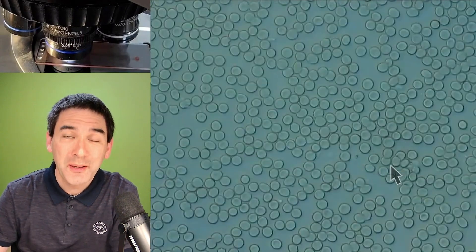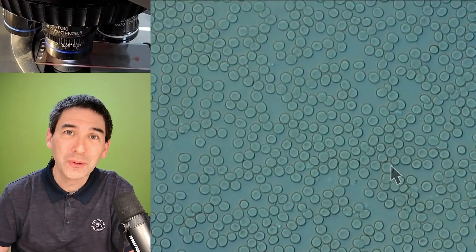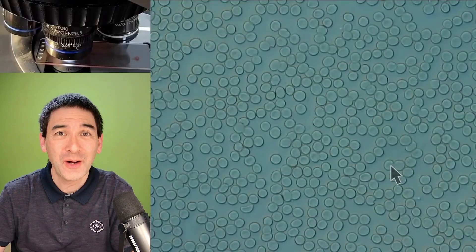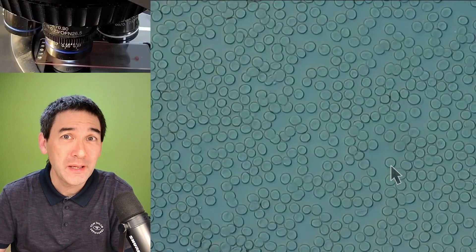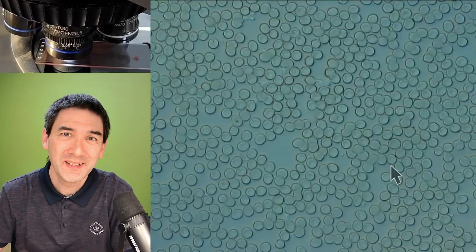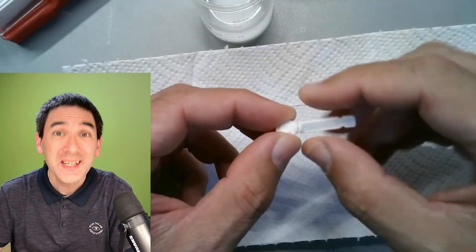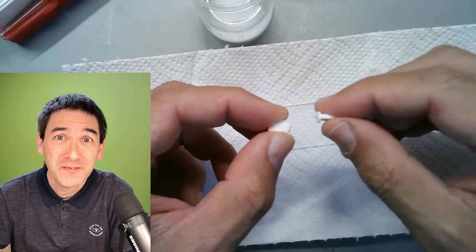These here are red blood cells under the microscope and today in this video I would like to show you two methods on how you can prepare a blood microscope slide and I'll also be showing you a staining technique to make white blood cells visible.